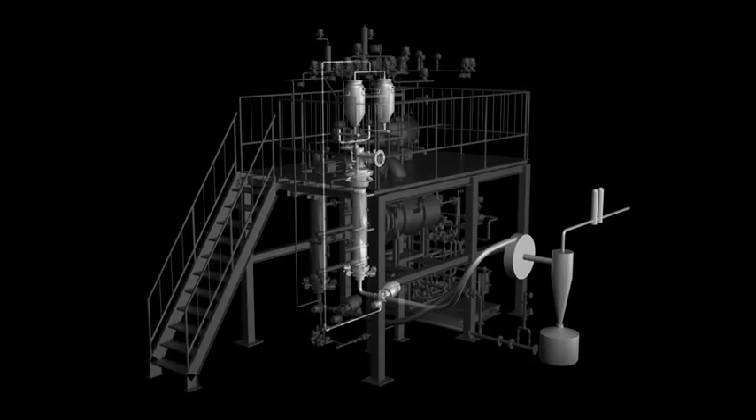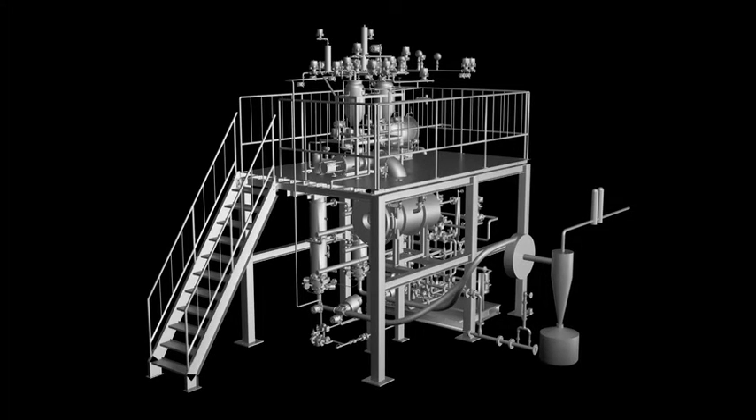This completes our explanation of the ICS, the Integrated Closed System Tube Type Lyophilizer.